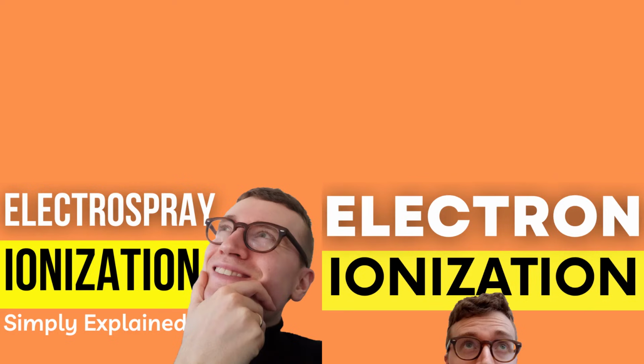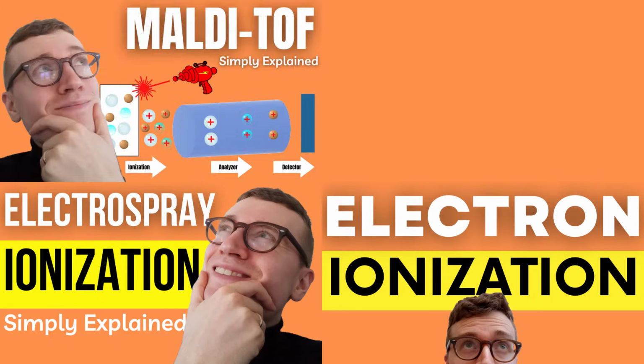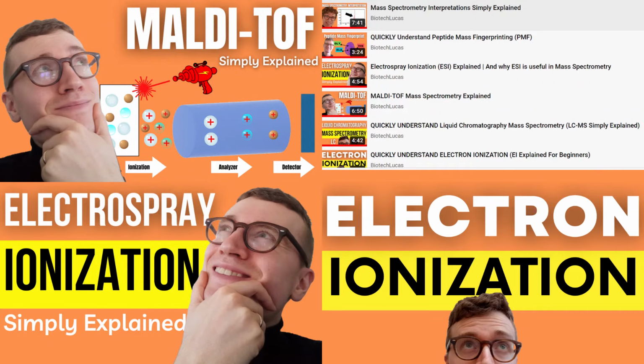My videos on electrospray ionization and electron ionization are two examples of ionization methods. In my video on MALDI-TOF, I briefly explained the ionization method of MALDI, as well as the time of flight mass analyzer. I will leave a link to my playlist containing all of my videos relevant to mass spectrometry by the end of this video.